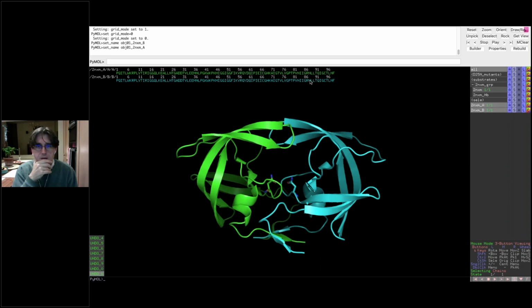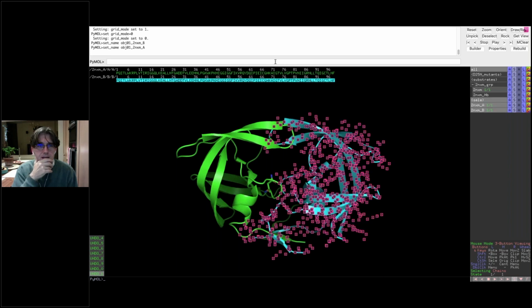Let's imagine that we've created a second object from, let's see.